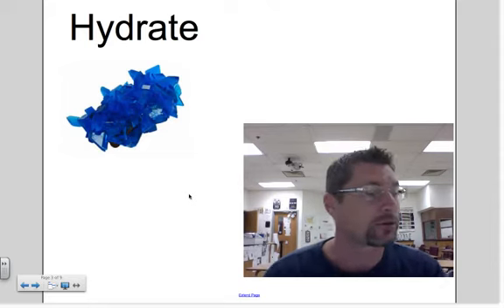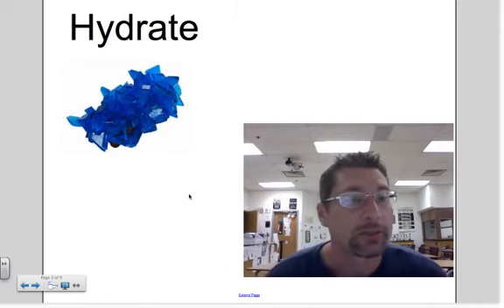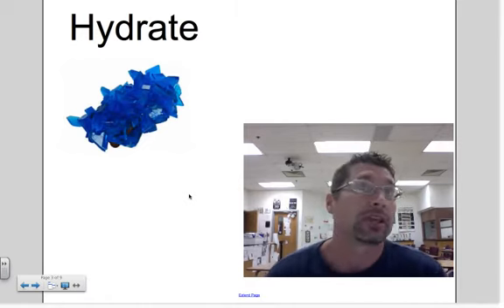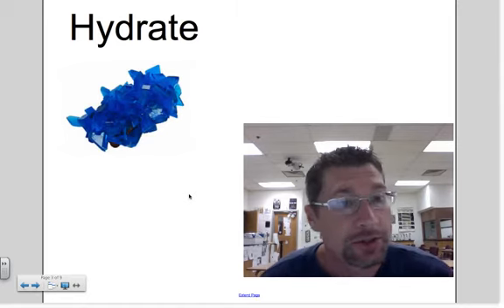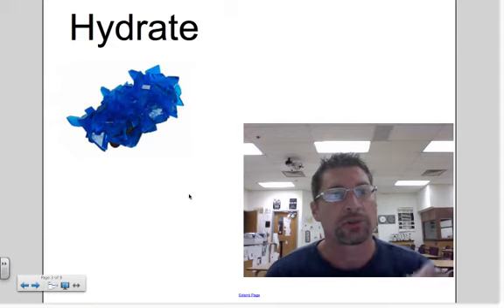This video is going to cover the Hydrate Lab. The Hydrate Lab is an important lab in chemistry. It's an important lab in Chem 1 and in AP Chemistry. As a matter of fact, if there was only one lab that you were allowed to do in chemistry, I would choose the Hydrate Lab.